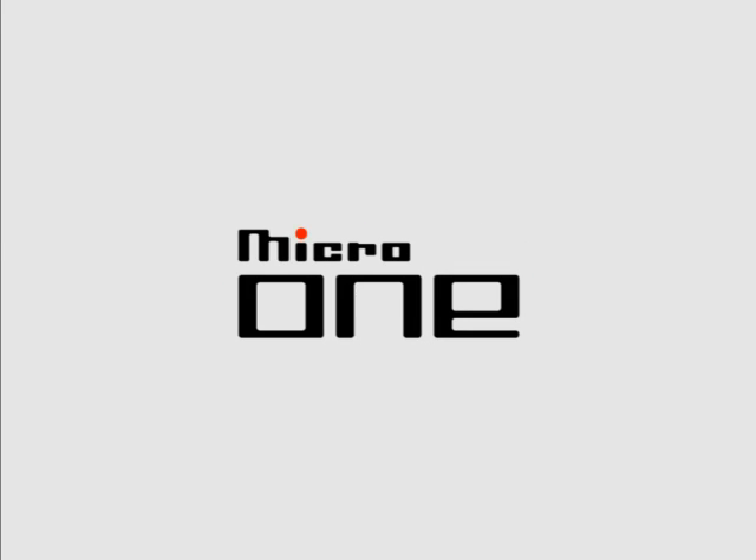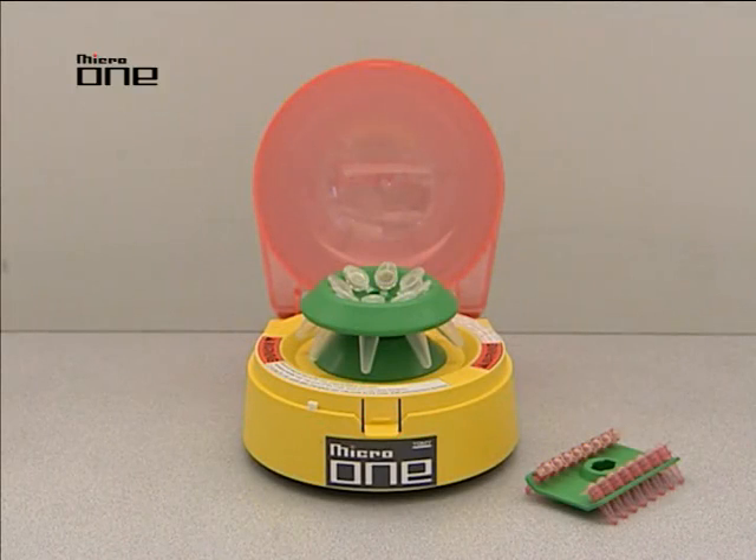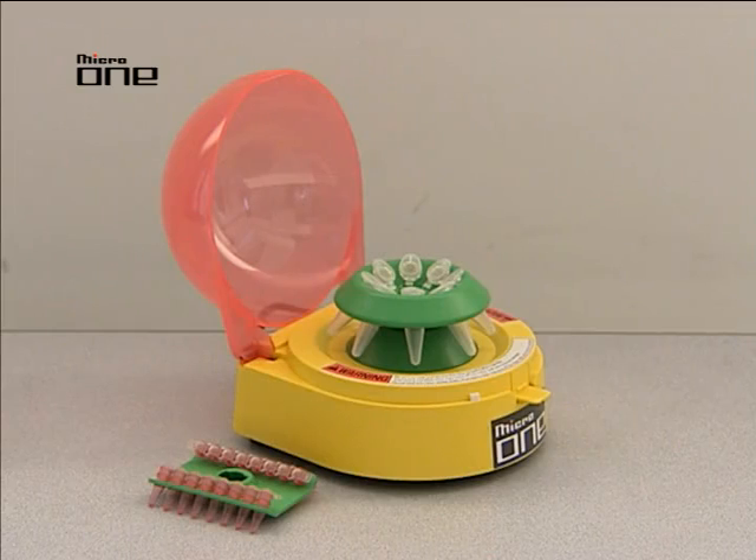The Micro One is a compact ideal centrifuge for easy operation. This space-saving design allows it to fit on your crowded workbench. It is very light and easy to carry.